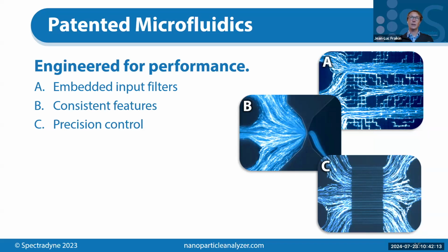I don't think you'd have any cross signal or any confusing signal from antibodies going inside and finding the target that way. In the LNP world, which is another part of our business, we use intercalating dyes to light up the nucleic acids inside nanoparticles. And so in that case, we're labeling the inside part, and that's just a different kind of approach. We could actually, I believe we've done this for EVs also, detected internal nucleic acids using that same idea. I didn't show the data here today. That'll be for a future webinar. So hopefully that answers your question.